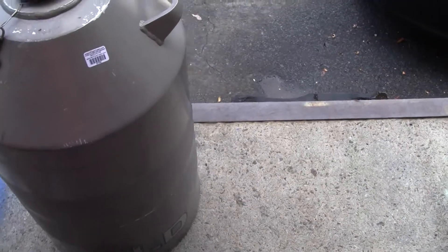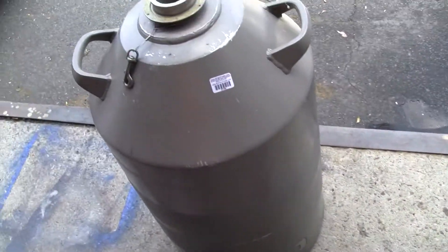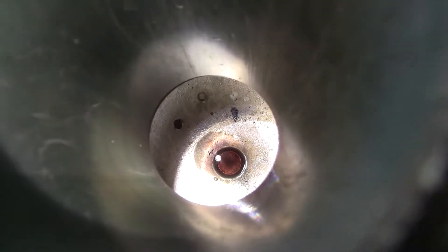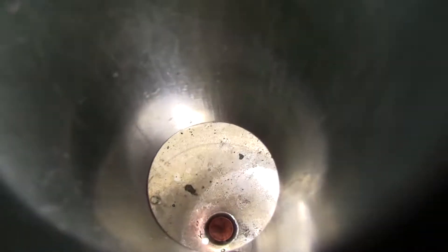All right, thanks Chris, put that down. Take a look inside, which is the more concerning part here. There's some kind of corrosion or dirt residue down there. It seems to cover the whole bottom.